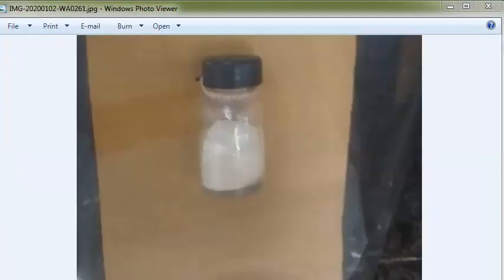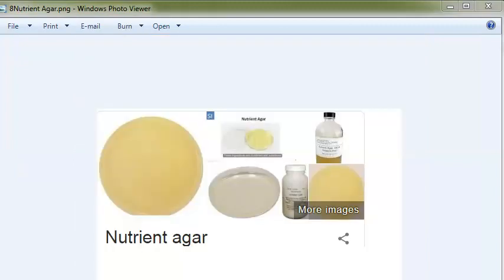Nutrient agar is made by adding 2% agar to nutrient broth. It is a basal media for cultivating non-fastidious organisms. If you reduce the agar concentration it becomes semi-solid media, which can be used to check for motility.